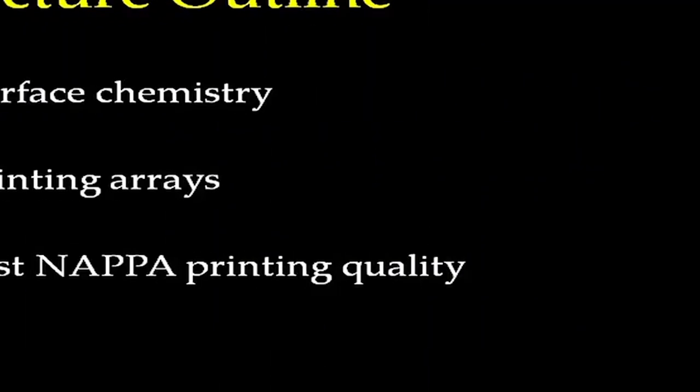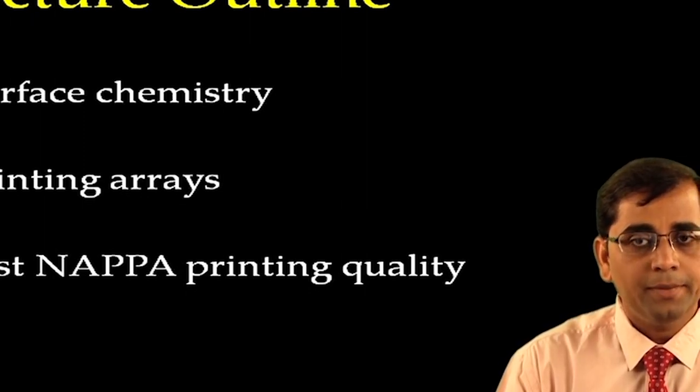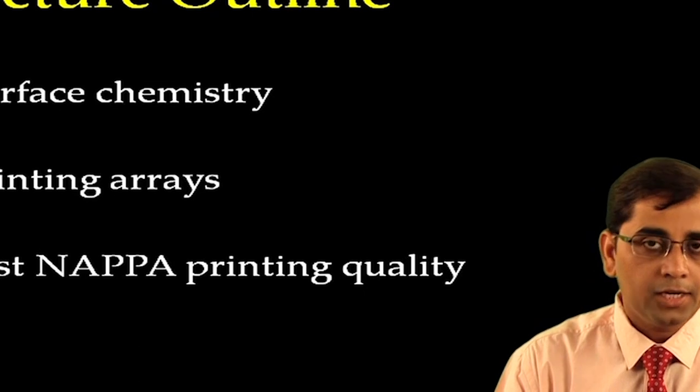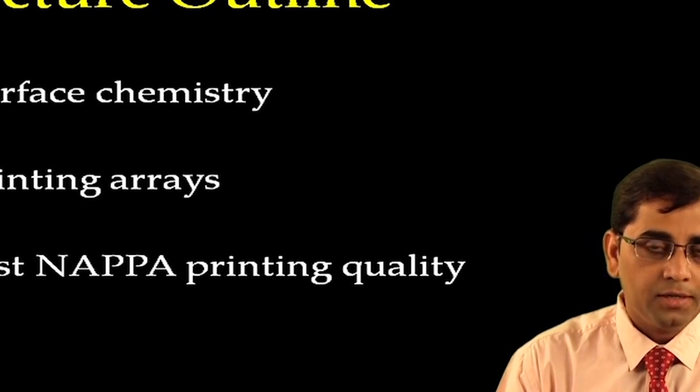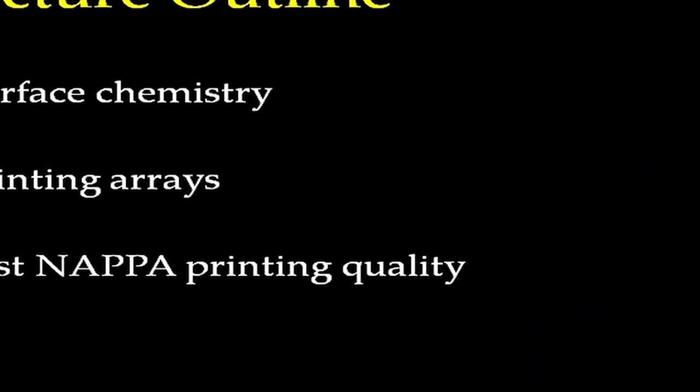Welcome to MOOC Interactomics course. In our previous lecture, we discussed the general workflow of NAPPA focusing on plasmid DNA extraction. In today's lecture, we will speak about the subsequent steps involved in performing NAPPA based experiments including surface chemistry, printing, quality control checks and protein expression.